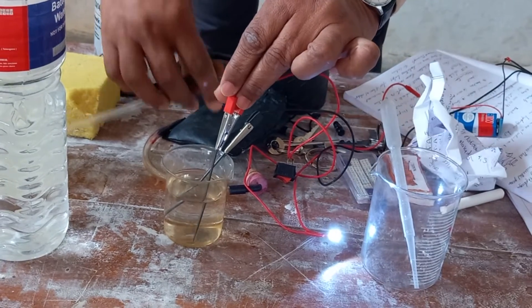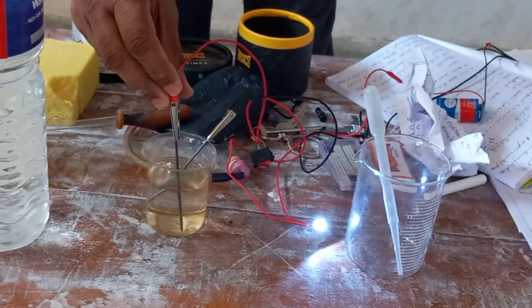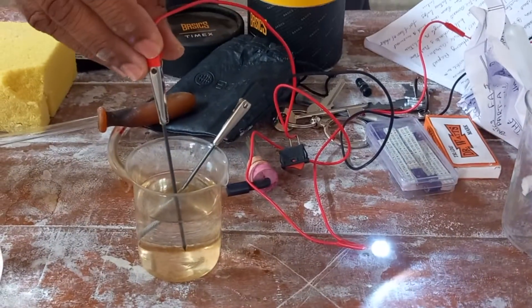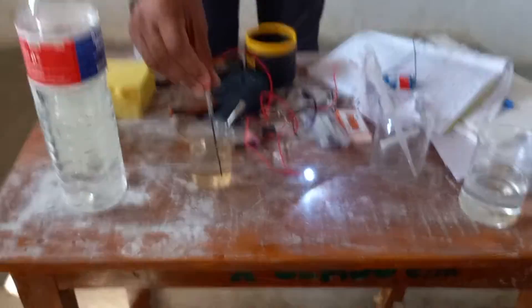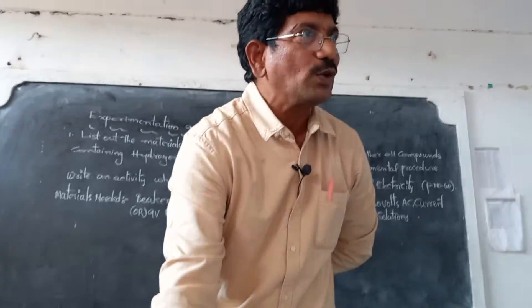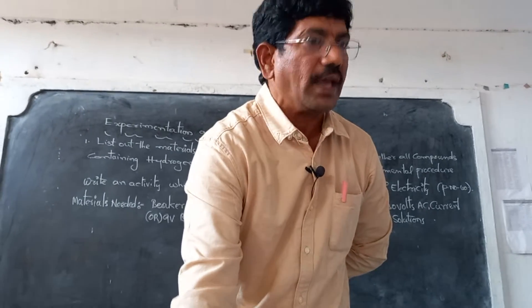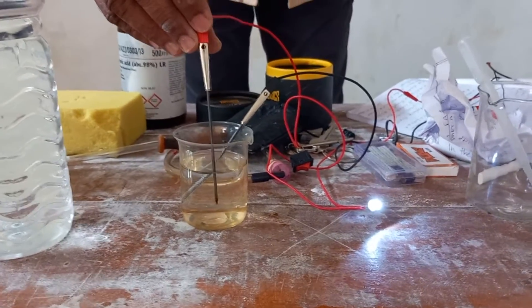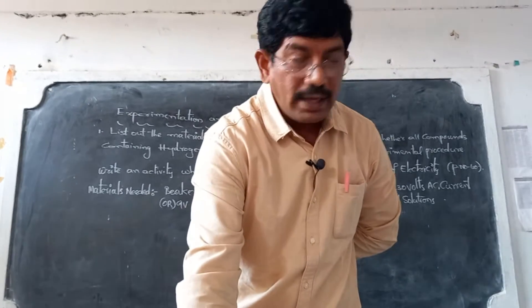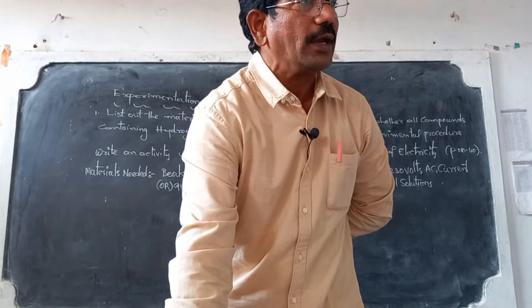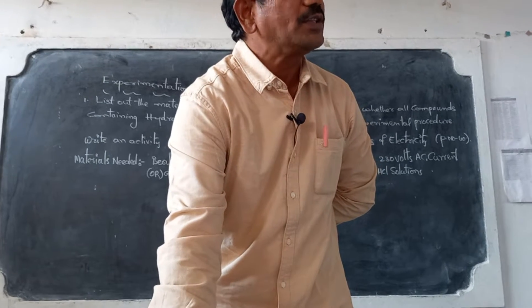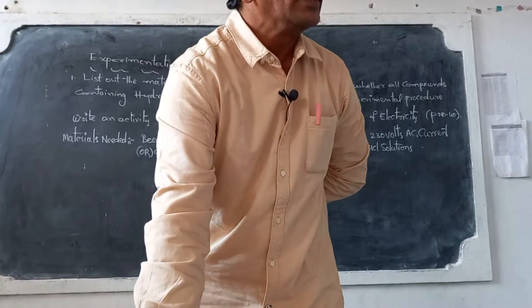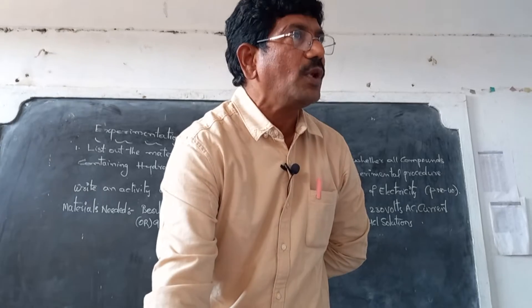Observe — is the bulb glowing? Yes, the bulb is glowing brightly. Why is the bulb glowing? When I add sulfuric acid to water it becomes an aqueous solution of sulfuric acid — dilute sulfuric acid. Dilute sulfuric acid splits into ions: H⁺ and HSO₄⁻. In the same manner, aqueous hydrochloric acid splits into H⁺ and Cl⁻ ions.